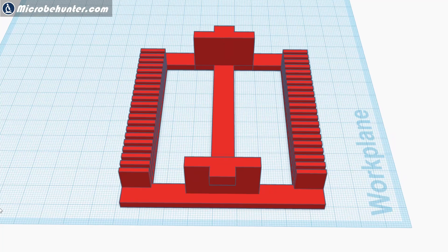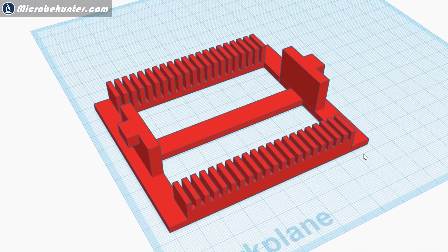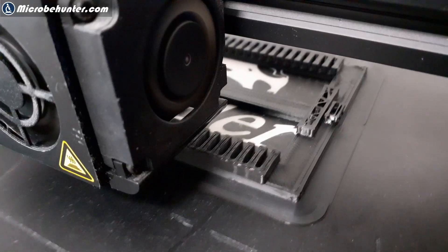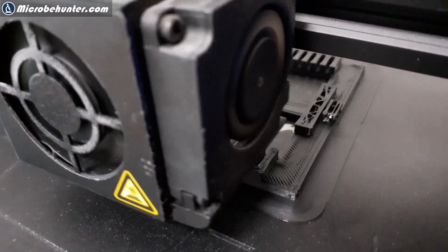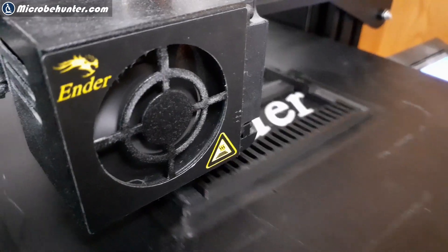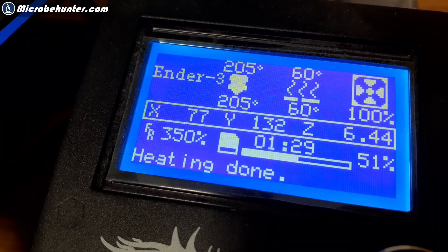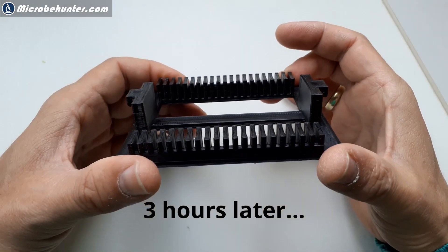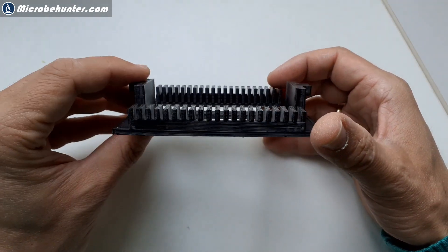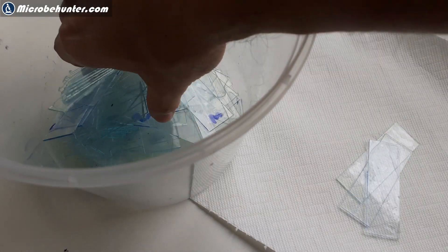This is the first prototype that I made. The slides are spaced approximately two millimeters apart, and I said I'm just gonna try it and give it a go. The 3D printing actually took around three hours. The project essentially required quite a bit of patience. After three hours it was finished, and I was generally satisfied — it looked sufficiently solid, though there's always the danger that some parts might break off. But it was a proof of concept.